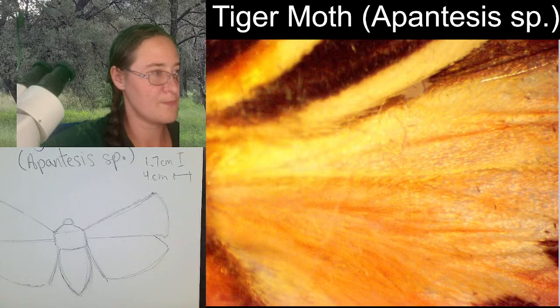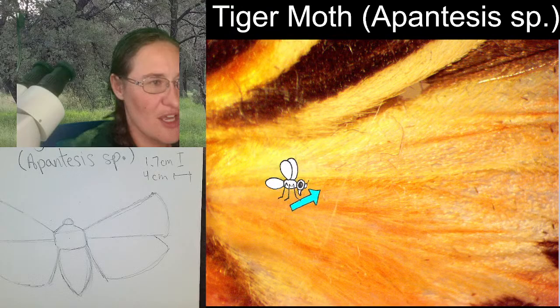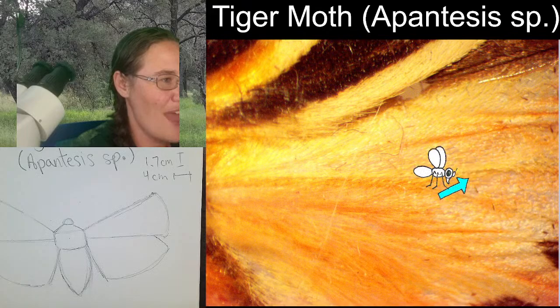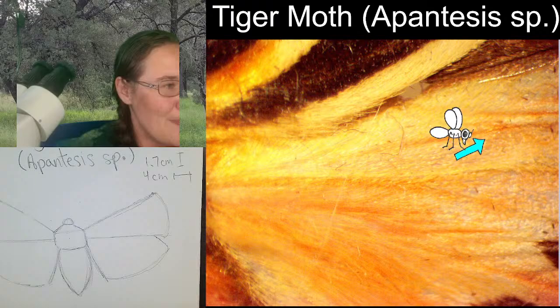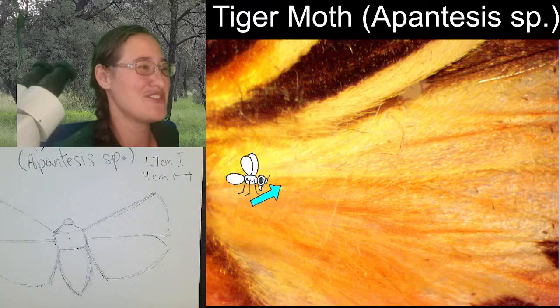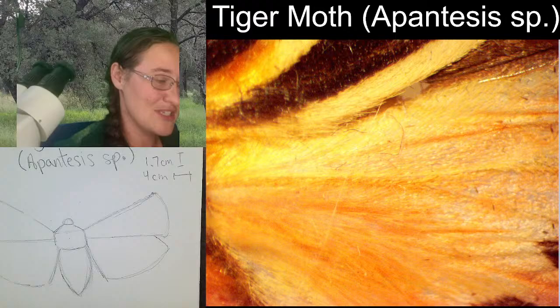While we're talking about the wing venation, this vein that you can almost see comes through right around here and then goes down and then splits here, and then you see this one, and then it kind of comes back. That's the cell in the hind wing. And if you look really close, right about here, coming all the way back to maybe connecting right around here, that is the vein that they're talking about. And that is how you determine that a moth is an Arctiid or a tiger moth. So it's a little tricky to see, and it's definitely not something that you're going to be able to see when the specimen is flying around.